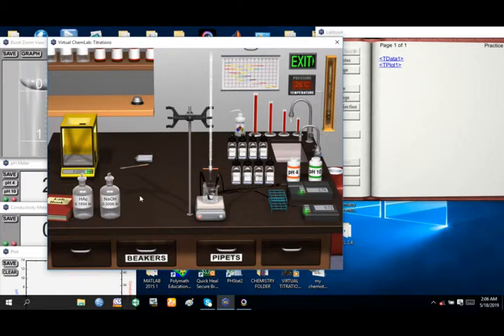Remember, the base is in the burette, and the acetic acid is 25 cm3 and is in the beaker. We are now titrating what is in the burette against what is in the beaker. And let's start the titration again. This is the orange handle.